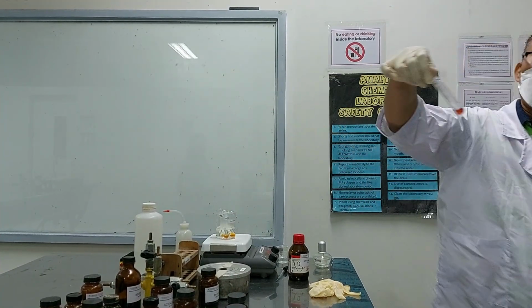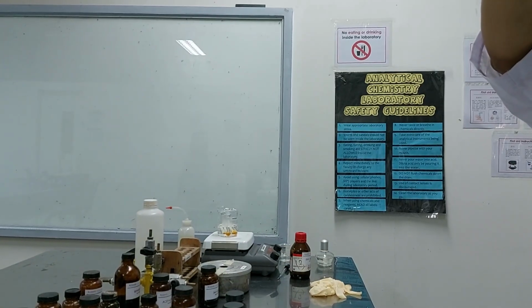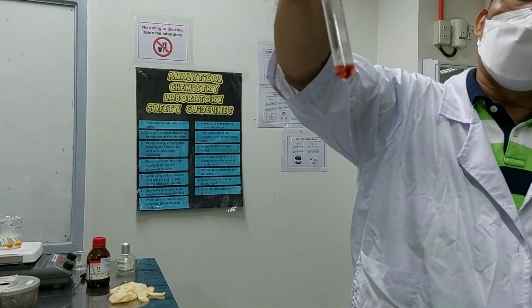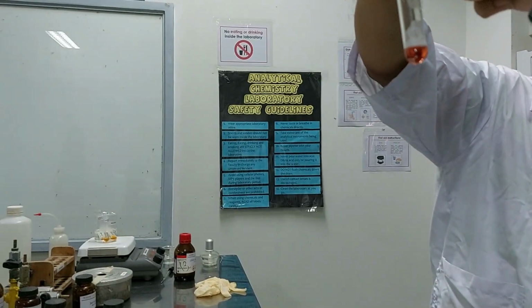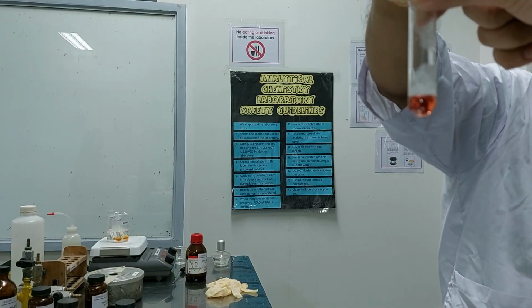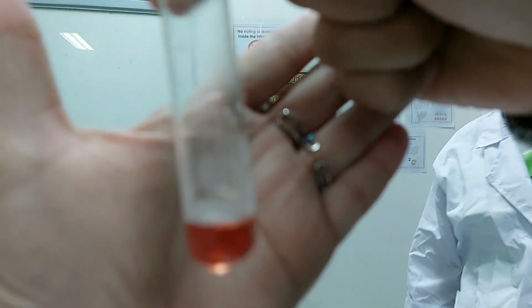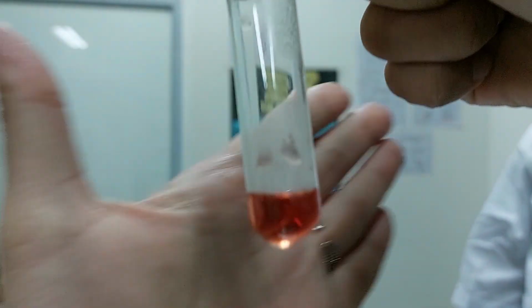Right. So here's the Millon's test class. You'll notice the change in color. Okay, so that's red. No, wine red. Actually, if it's concentrated, it's bloody red. So it's wine red, no? For Millon's test, okay? So that is the test for phenols.